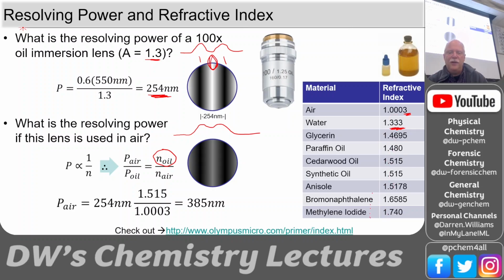We have all of these different ones, with the biggest being methylene iodide. You see these iodines and bromines. They really increase the refractive index. Why might that be? Why would you expect iodine and bromine to have such a high refractive index? I want you to try to get some intuition about this. Not the electronegativity. The first part, yes.